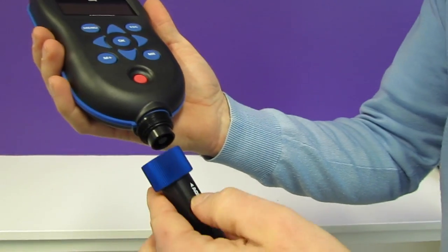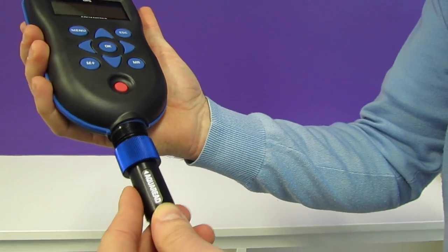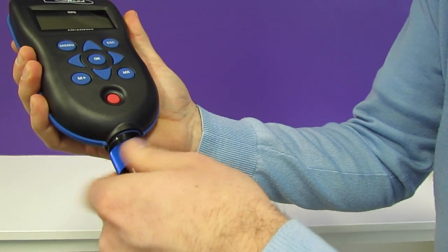Let's connect the meter up to one of our cables. We face the AquaRead logo forwards, push together and screw the collar together.